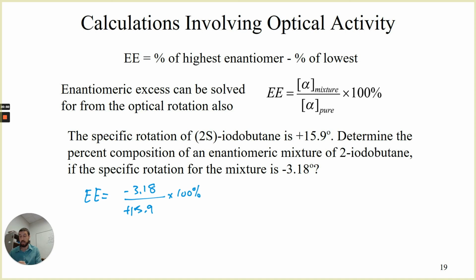If you're getting a negative value for your mixture, which enantiomer do you have? Well, you don't have the S, you actually have the R. So what we could go through and do is change that to a negative. Okay? This is going to help us to analyze our end result. I also don't have a calculator immediately handy, which makes this calculation a little bit more challenging and time-consuming, which is fantastic because we're getting recorded through this process, and I'm really now just wasting your time and mine as I try and go through and run the calculation in a calculator. That took a little bit of time, but there we go. We get an enantiomeric excess of 20%.